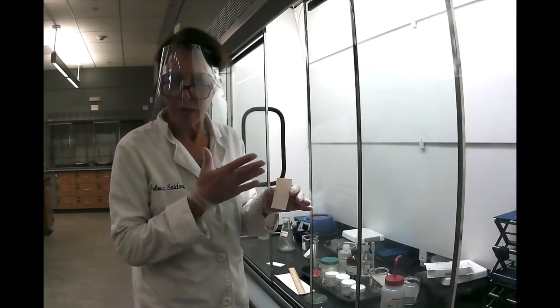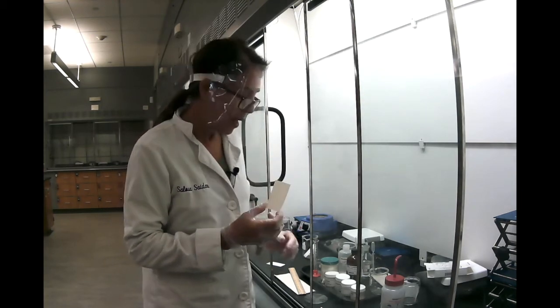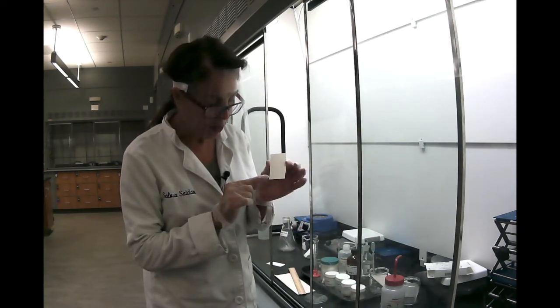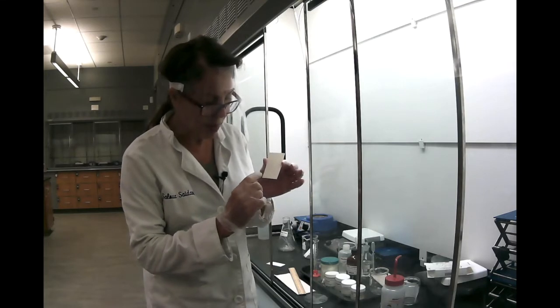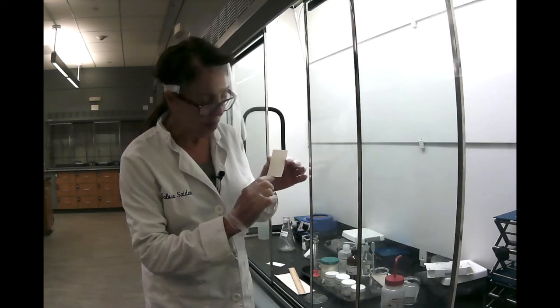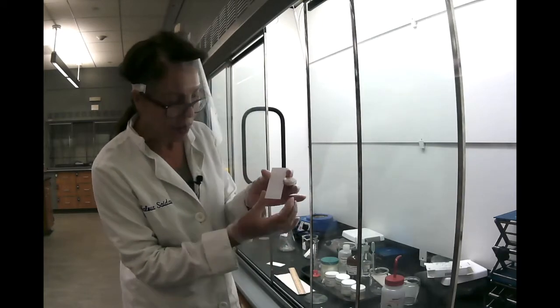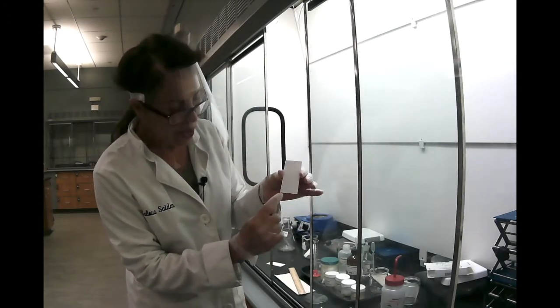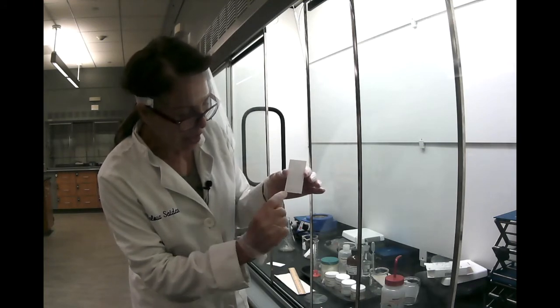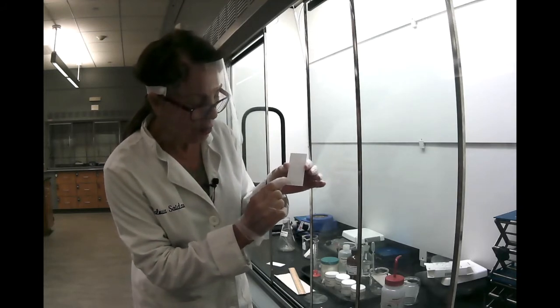So before we develop a TLC plate, we have to prepare it. So how do we prepare it? You take the plate and you're going to put a few dots wherever you're going to put your substances about a ½ centimeter above the bottom of this plate. And this is what I did. We have here a plate that is ready to go. So a ½ centimeter from the bottom, I used a pencil and very slightly I put a few dots.